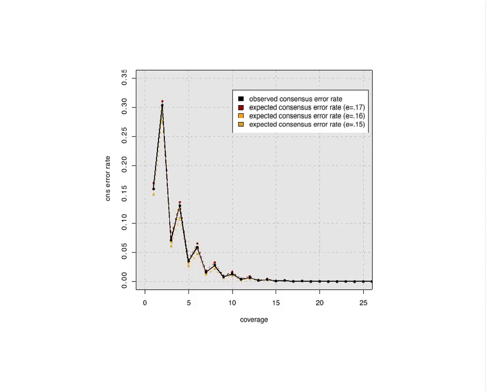If you're interested in things like haplotype phasing or structural differences versus the reference genome, then yes, the PacBio reads would give you an advantage there. If you were looking for any kind of variable number tandem repeat profile changes, any kind of chromosomal disorders, fusion genes, anything that has a structural component, you get an advantage with the long reads. But if it's just a population SNP study, then short reads are the way to go.